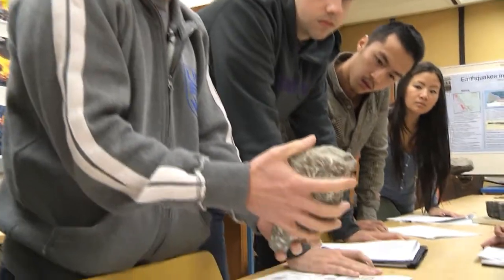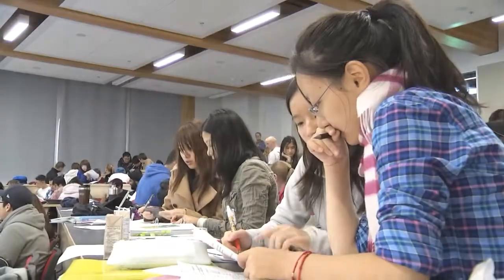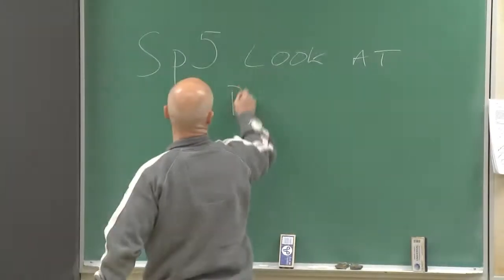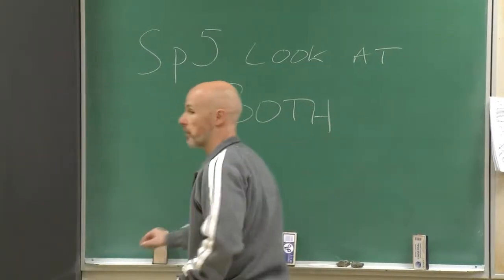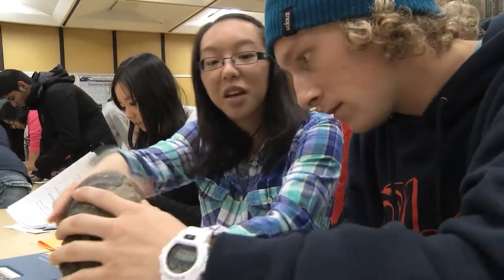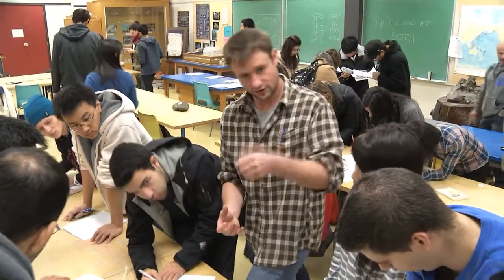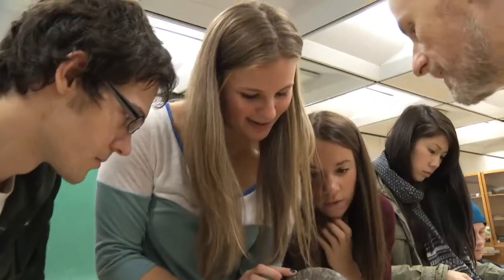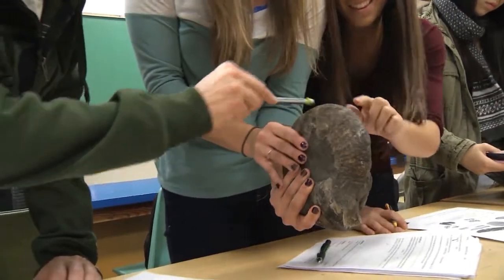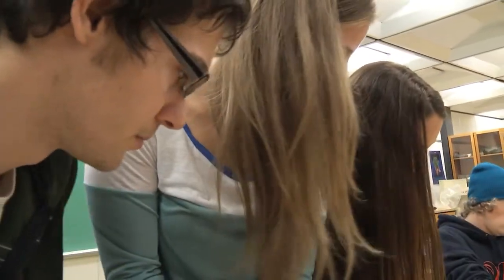This video demonstrates what it's like to run a 50-minute lab exercise that will be followed up a week later in a 50-minute group-based activity for the whole class. Some of the keys to success include designing a meaningful overarching purpose with each task contributing towards it, creating tasks that need discussion among peers and that apply recently learned concepts, enabling expert-novice interactions for all students, and balancing variety and complexity of tasks. The hands-on lab shown here focuses on handling and observing real samples and gathering data that will be analyzed and synthesized in subsequent work.